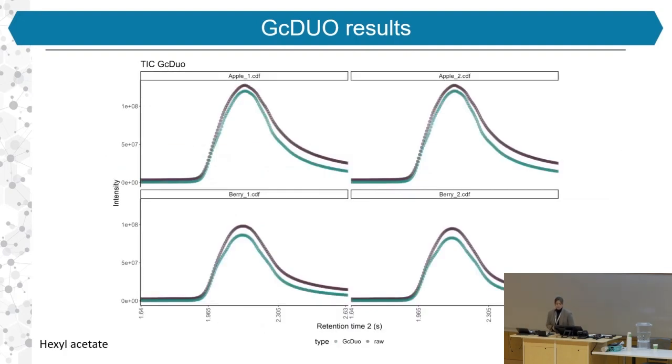We also observe that when we use PARAFAC, there is a degree of noise reduction in our data. From all of the results, the only thing that we have done is PARAFAC, and we are presenting the results. As we see in blue, the line obtained after PARAFAC is approaching 0. This helps in the noise reduction and avoids more steps in all the processing.